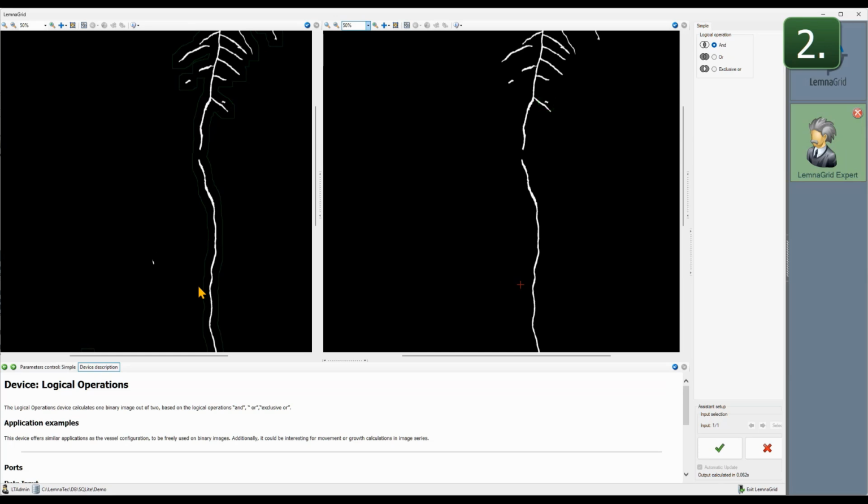As a result of these operations, all elements that are root-like by shape or size are kept, as well as all other objects which are close by to the big roots. The latter are likely small root fragments which belong to the root system itself. This includes also smaller roots in a distance from the main root system, as long as they are big enough and root-like enough. However, all other objects are removed. They are likely just false detections.